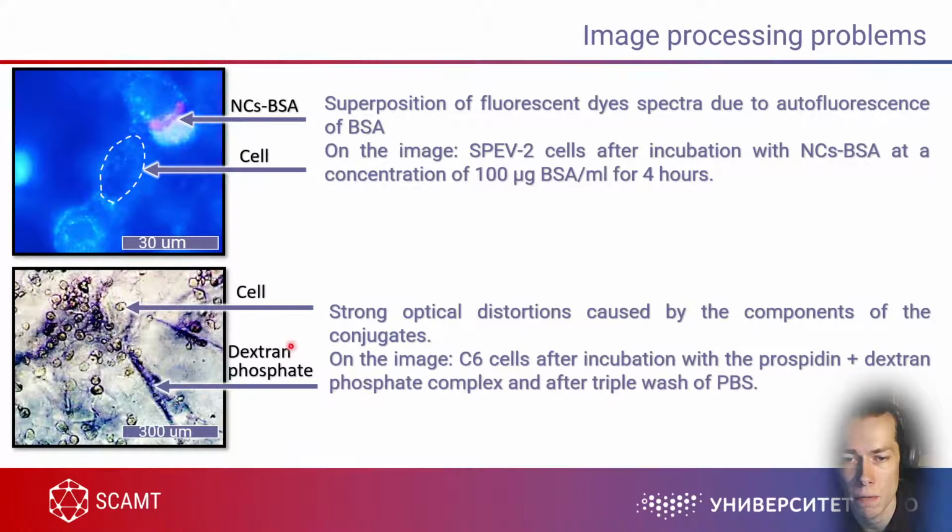In case you have some gel, for example, your cells growing in some gel matrix, there can be some interference from this gel, for example, dextran. This dextran, not molecules, is just a border of the gel, and it will be very hard to obtain good fluorescent images when you have interference from gel structures.